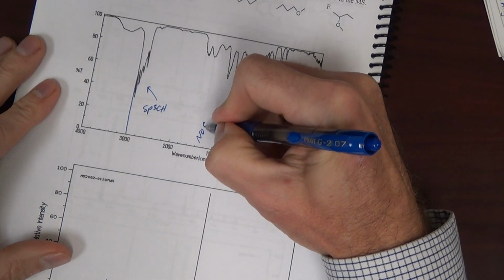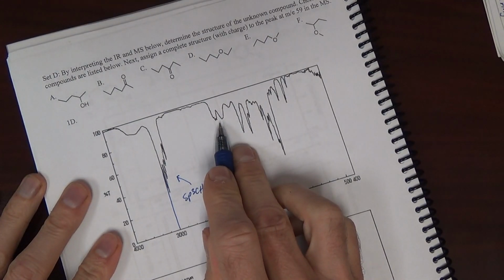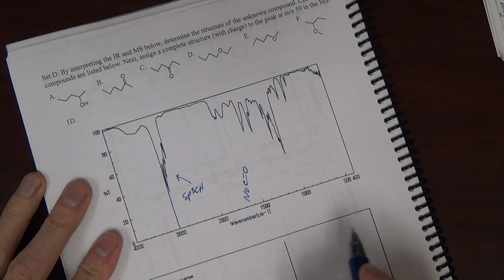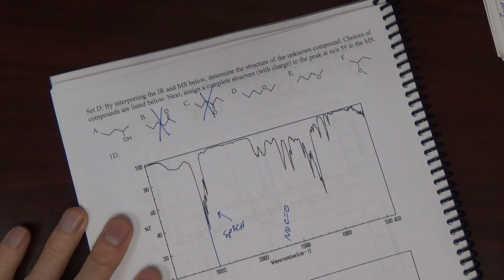No carbonyl. About 1700 range. I mean, this is not a carbonyl. The carbonyl would be a strong peak. No carbonyl there. Guess what? We can already exclude those two compounds.